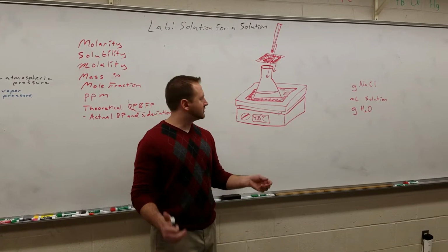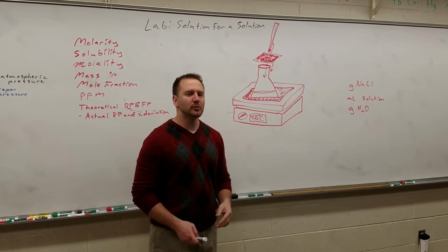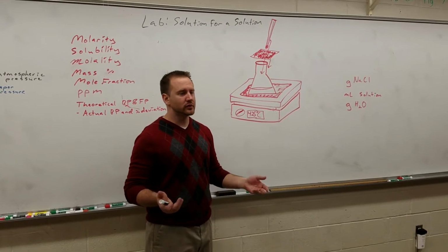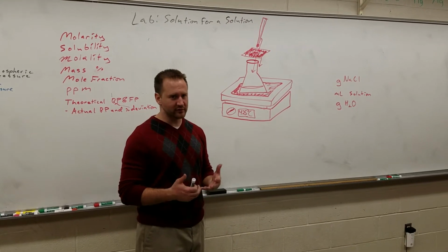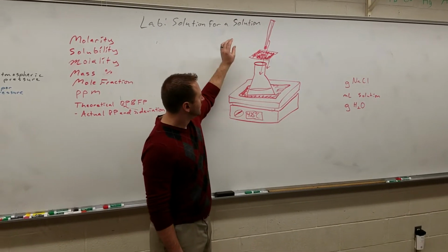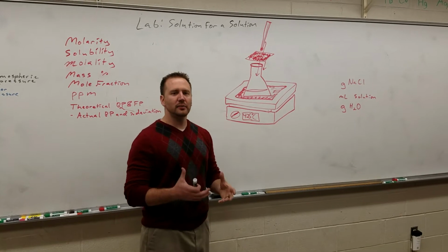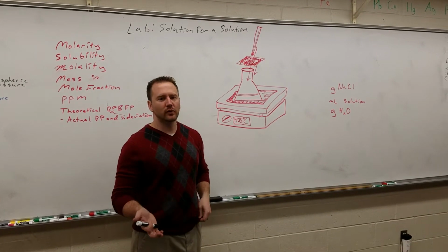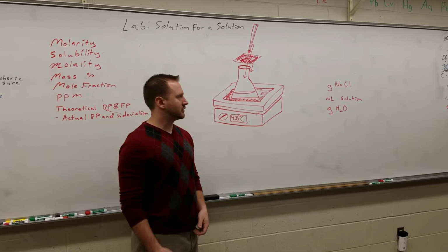The recommended procedure is that I would say you should put some aluminum foil underneath the Erlenmeyer flask in order to capture any overflow, so that we collect all of the salt that's in the solution and you don't lose too much. And then I'm going to ask you to cover the top with a piece of aluminum foil that you have poked some holes in so that the water vapor can escape but you don't get too much splatter.